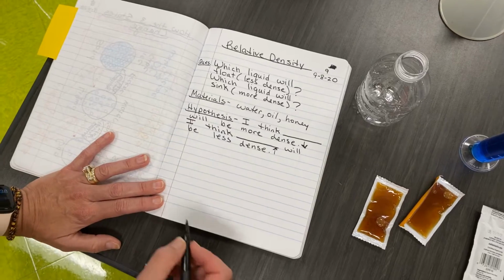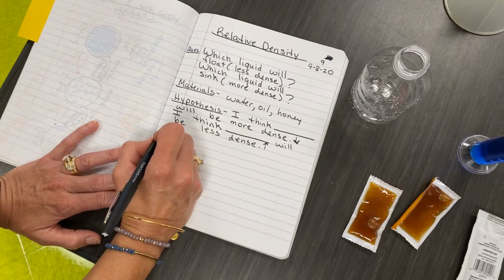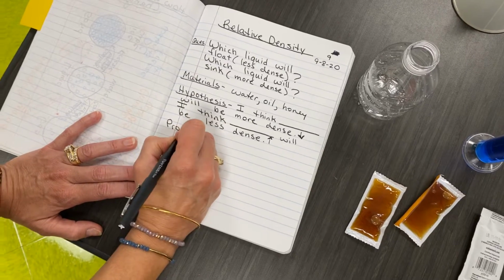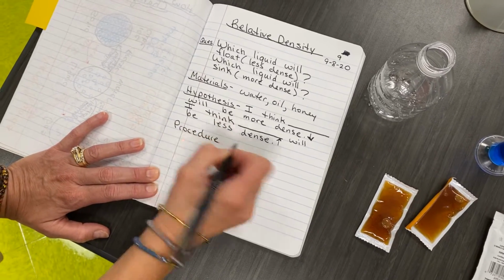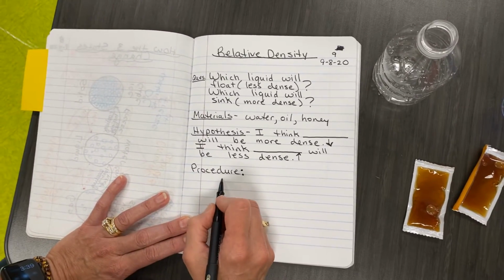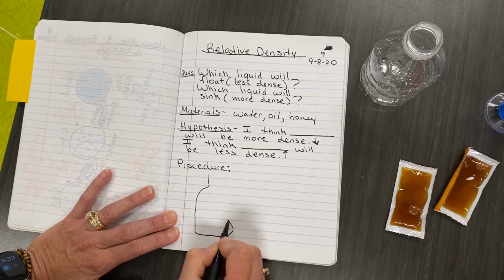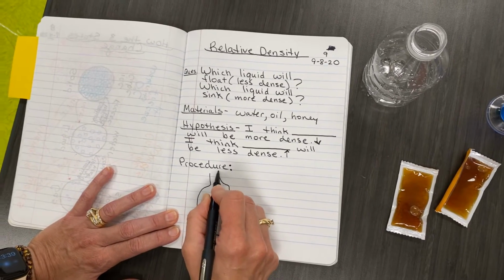Okay, now we are going to do our investigation. We're going to do the procedure, the step by step, the procedure. So to document what is happening for my chart, whoops, it's kind of a sad looking water bottle.